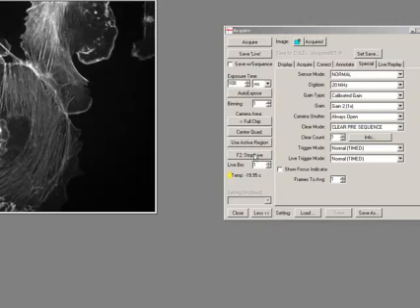If we put it back into normal, 100 milliseconds, we should expect with these types of cameras a frame rate of 10 frames a second. There we are, 10 frames a second. So this only really helps you when you have longer exposure times, like a second. My frame rate for a second should be 1 frame every second, and that'll be pretty true for alt normal as well. In fact, it'll just be slightly under.